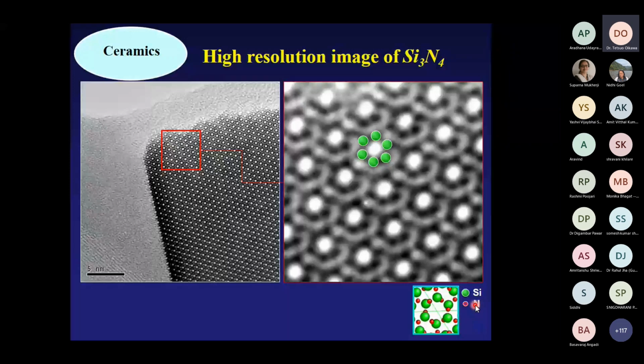As silicon is relatively heavy, we can observe the silicon atom location as a black spot, like this. The center white is a hole, no atom area. Electrons pass through the center holes at a strong intensity like this. Here we can clearly observe the high resolution atomic arrangement structure analysis in high resolution imaging.